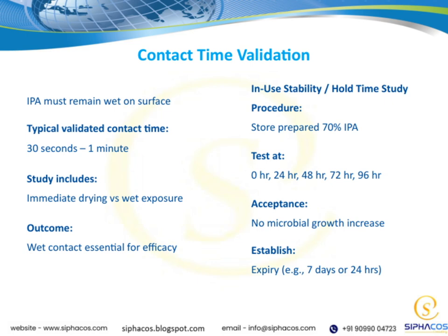The main takeaway here is that wet contact time is a vital factor for the efficacy of the disinfectant. If the surface dries too quickly, it may reduce the disinfection effectiveness, which is why understanding and validating this contact time is so important for reliable surface disinfection.